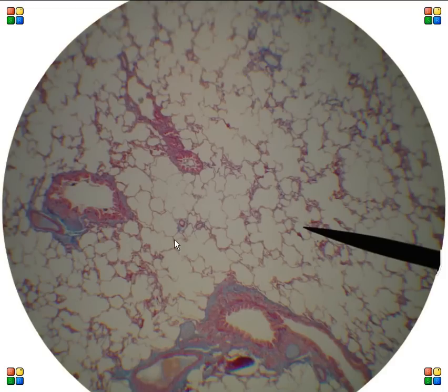And we're back to the beginning. Another nifty thing, this is a bronchi or a bronchus, and it's a bronchus because we can see cartilage at this level. See the little areas of hyaline cartilage here and over here. This one doesn't have cartilage around it and it's smaller, so this one is actually a bronchiole instead of a bronchus. Just kind of a nifty thing to know.